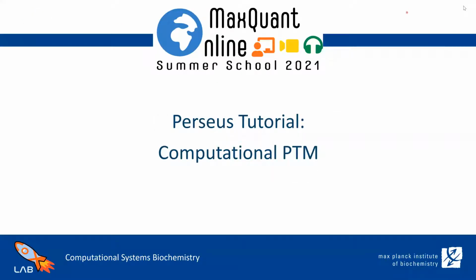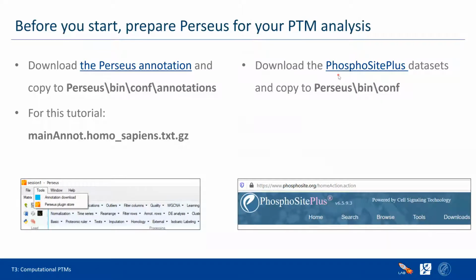So hello everyone. Some of you may remember me from yesterday, when I was giving the post-translation modification lecture. Today I will show you the Perseus tutorial for this computational PTM. I prepared a few slides before we start working interactively on Perseus.